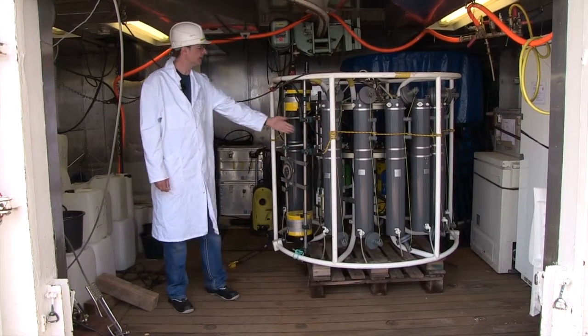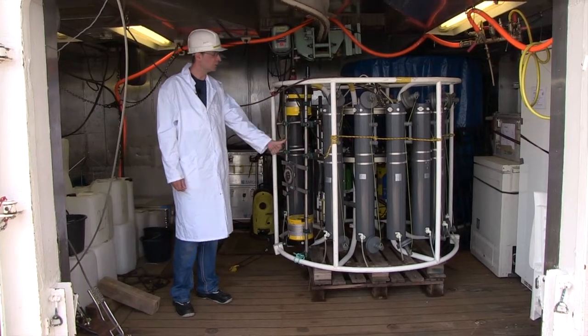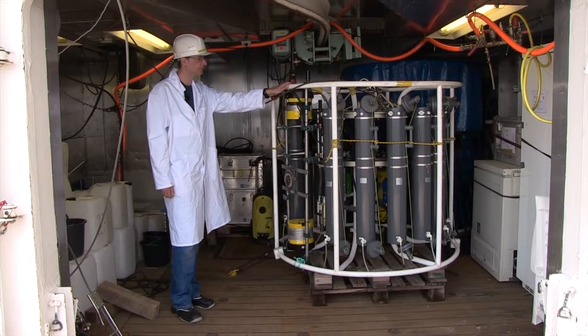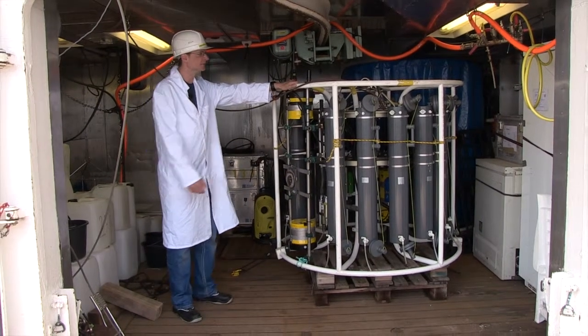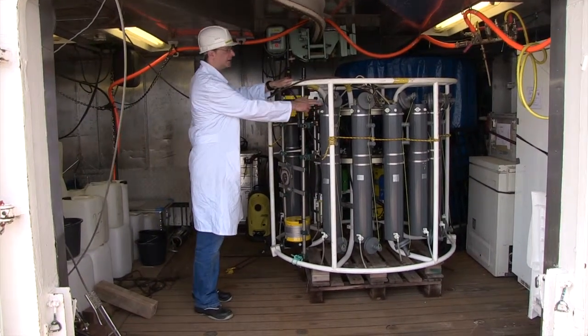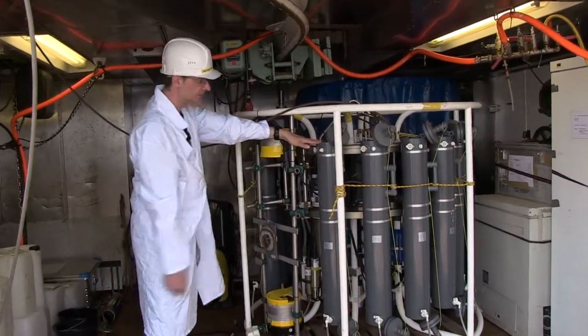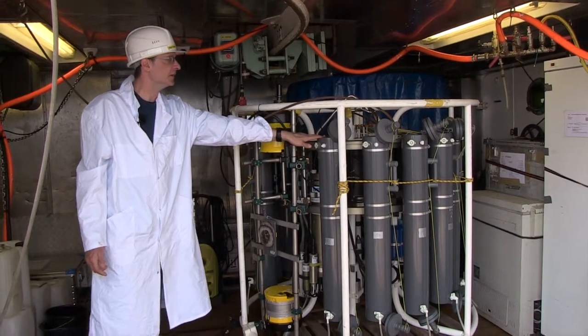This is the CTD rosette. In the center, it contains a physical measuring unit which records temperature, conductivity, and depth. As soon as the CTD rosette is lowered into the water, we are able to close each of the 14 individual water samplers so that they retain the water that is scooped up, bringing it to the surface.